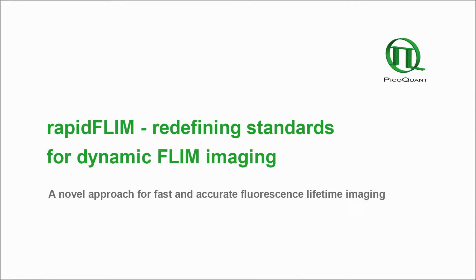Hi, my name is Tanya. Me and my colleague Manuel will provide you with a short introduction into the concepts behind rapidFLIM, the setup used for it, and an application example.